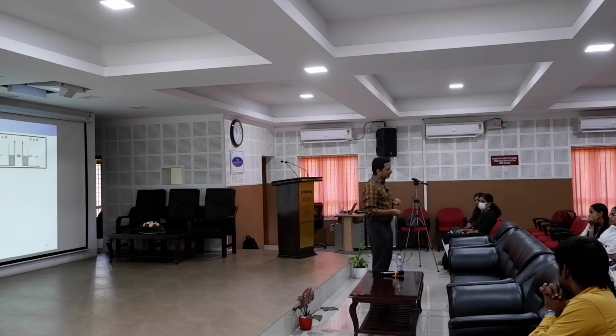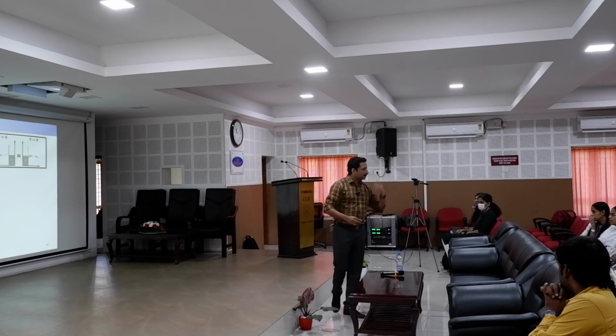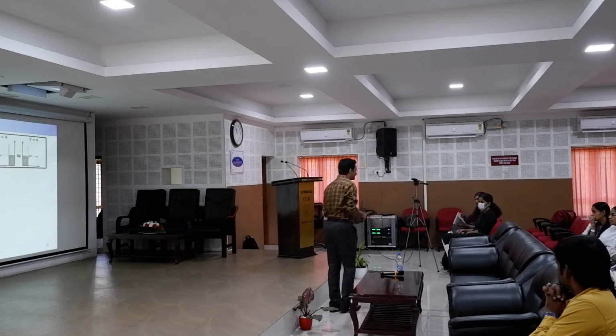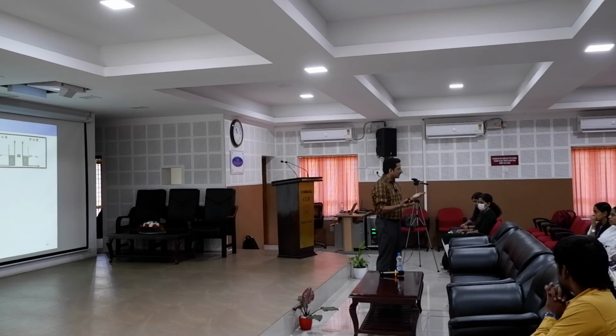Reverse the voltage. Negative on the molecule, positive on the tip. Now I am getting electrons from the molecule to the tip. And now the valence band is full, so I can take electrons from there. So electrons will be coming from the valence band of the molecule. Okay, you are getting the ground state. And this will be totally different, interestingly. So to know what is the shape of the ground state and excited state of the molecule, we have to do DFT calculation. And we have to check whether that is what we are getting.